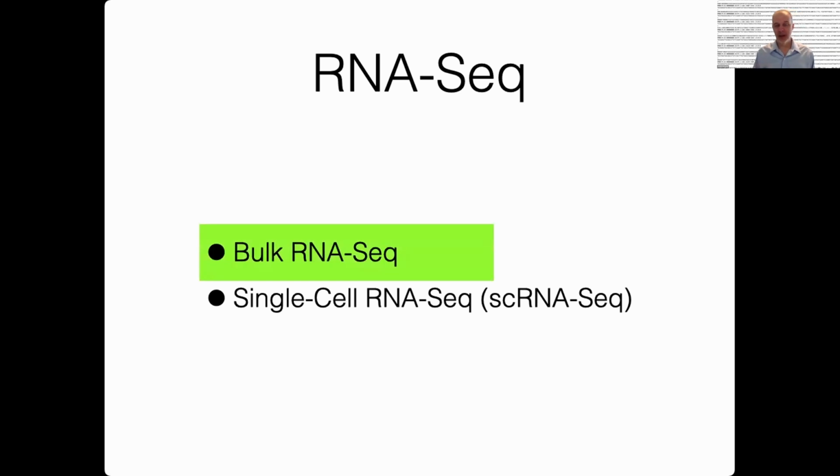Again, this week I'm going to be talking exclusively about bulk RNA-seq, but understanding bulk RNA-seq is, I'd say, essential for understanding single-cell RNA-seq, because single-cell RNA-seq is just adding a little bit of a layer of complication. A lot of what we talk about this week, we're going to build on next week when we talk about single-cell RNA-seq.